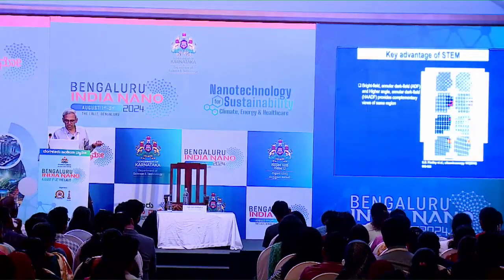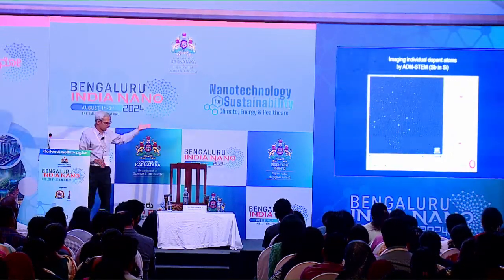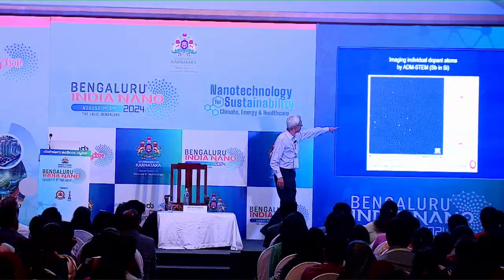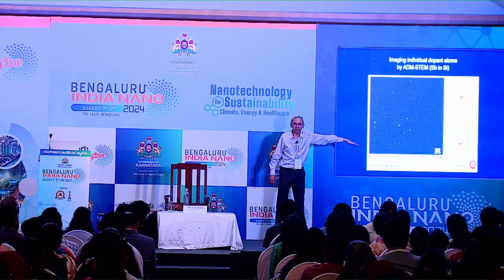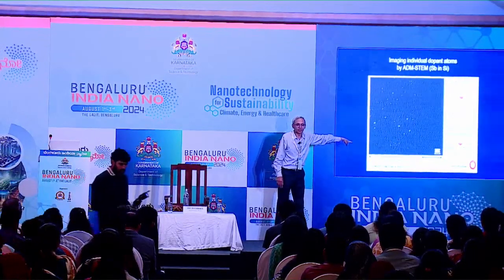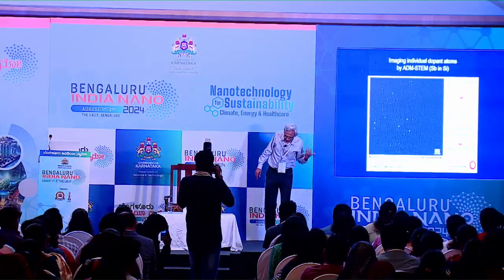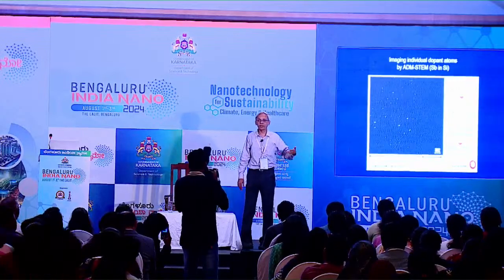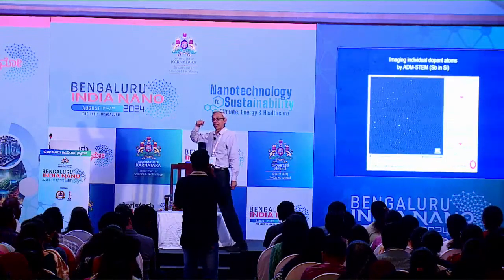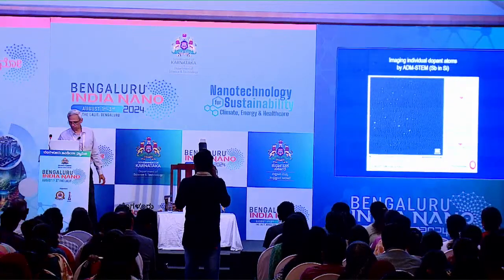So it can actually do multiple things. Okay, so I will just skip this. So this is what the image looks like. From Bell Labs in 2002, they showed that on the right hand side, in pure silicon, you don't see any of those white dots. Once you introduce antimony, the bright dots are antimony atoms sitting inside the columns. When a dot appears brighter, it means that there may be more than one atom, 2 atoms, 3 atoms, 4 atoms, or whatever it is. So you can clearly see that at atomic resolution, you can see what is sitting at the individual atomic columns. That is the power of the modern day electron microscope.